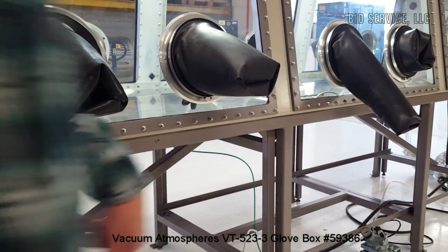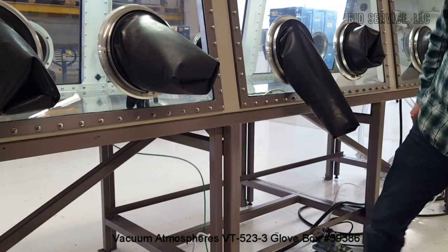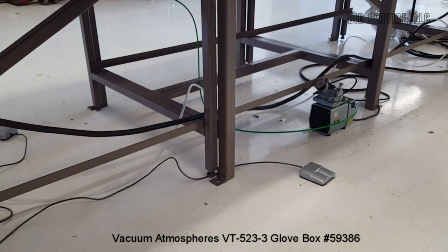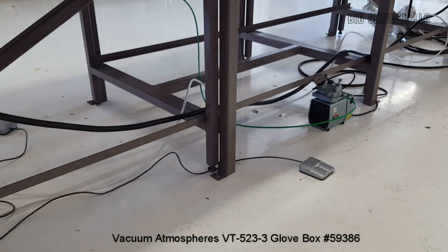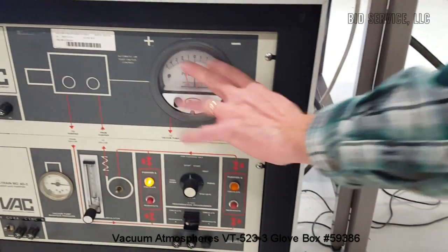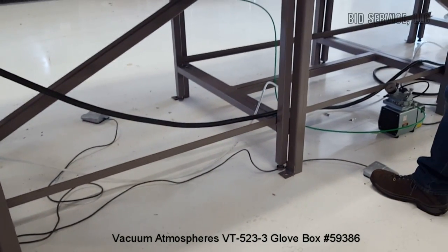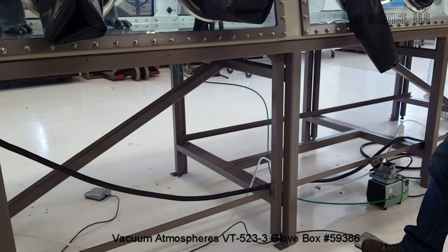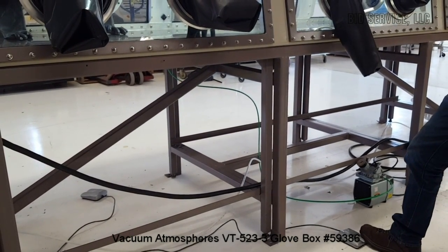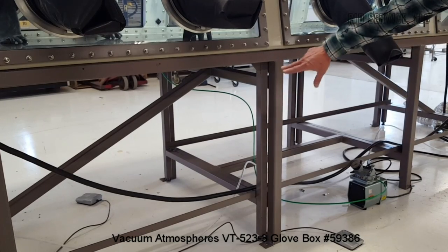We also have foot pedals down here — one on the other side, one here — left and right. They do the same as the pressure controller but the controller keeps it within range automatically. For example, hitting the left side of the pedal evacuates the box; the right side adds pressure. There are two foot pedals, one on each side.